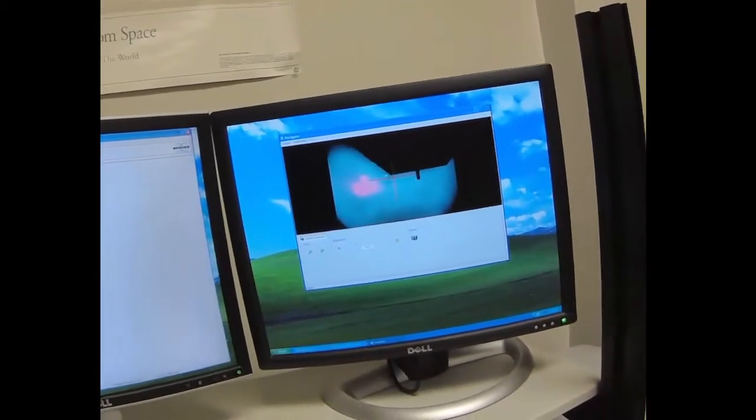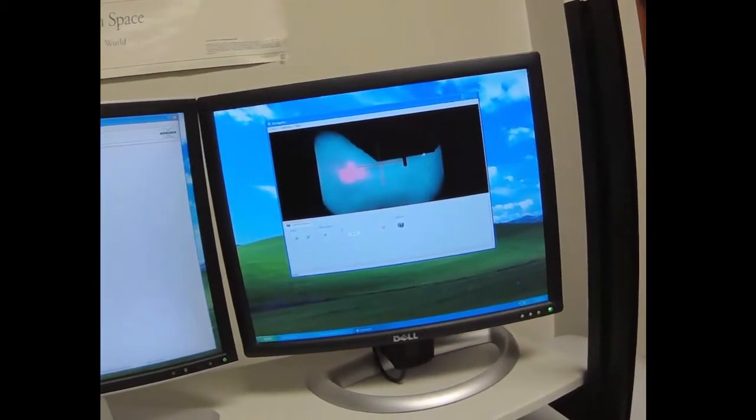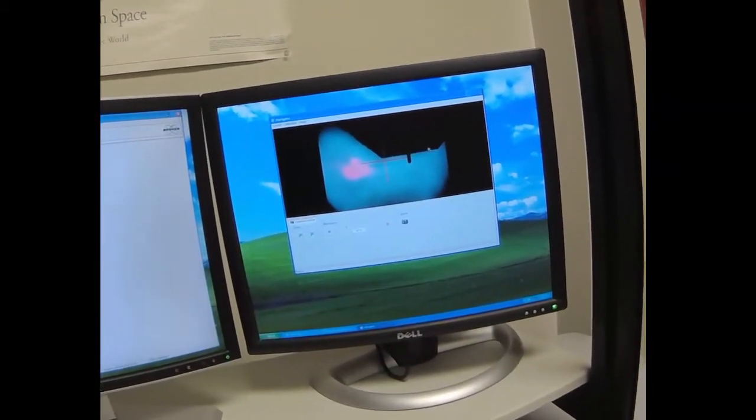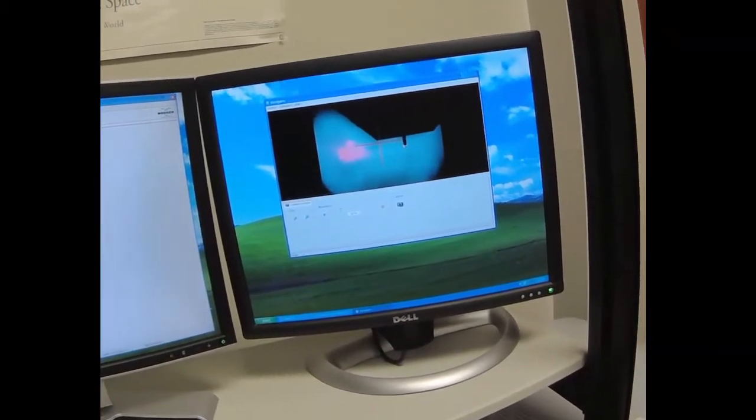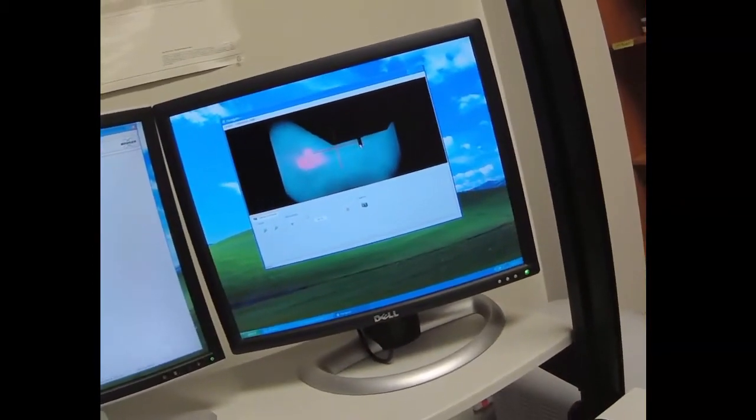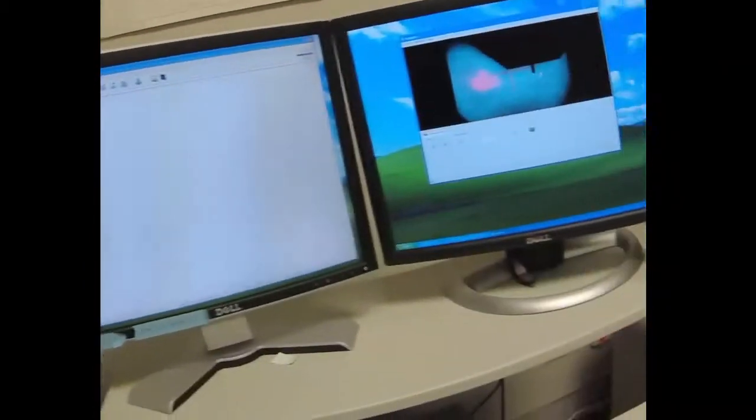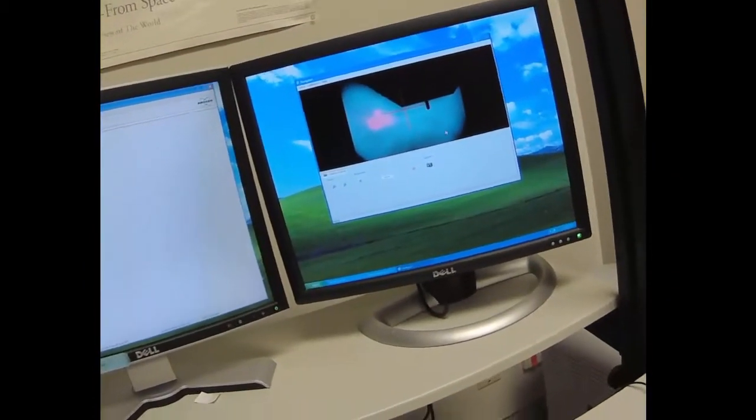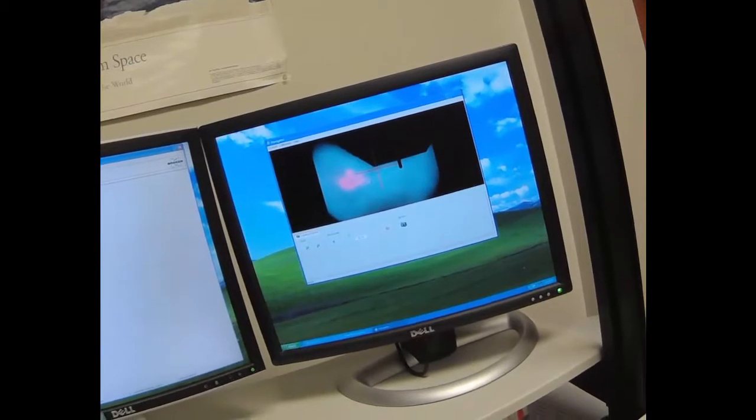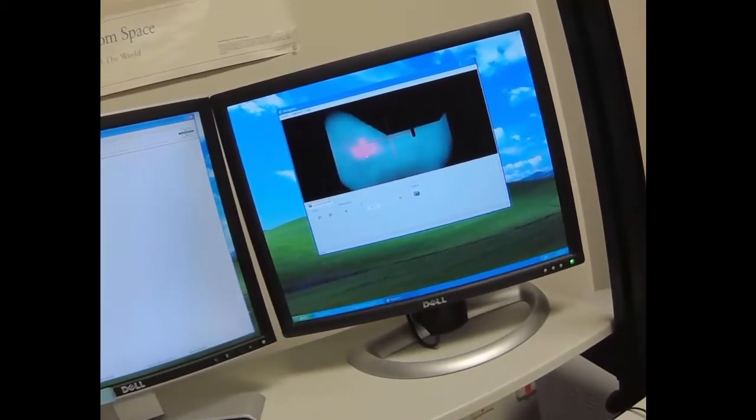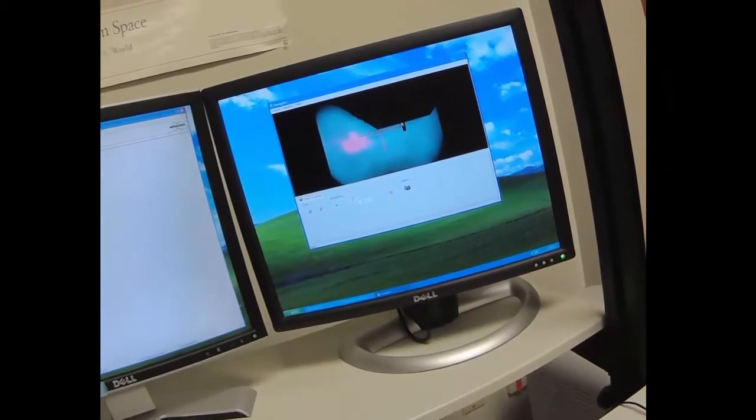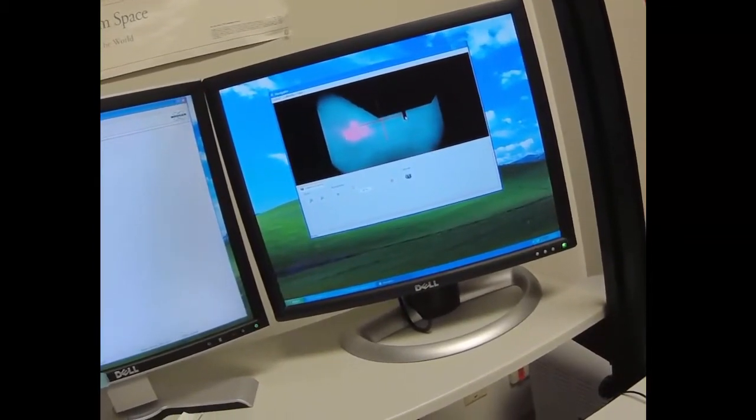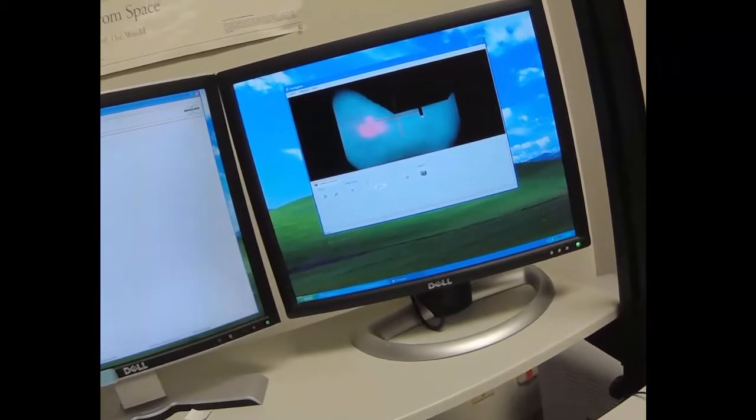Let's zoom out so we can see everything. That's that trapezoidal shape that we saw before. And now here you can see the cantilever that's sticking out from that. That was too small for us to see with our eye, but we have a little microscope here to help us. What I also noticed is that there's this red spot here. This is where the laser is hitting the surface of the sample. It is not hitting the back of our cantilever yet. And I'm going to show you how to tune it.